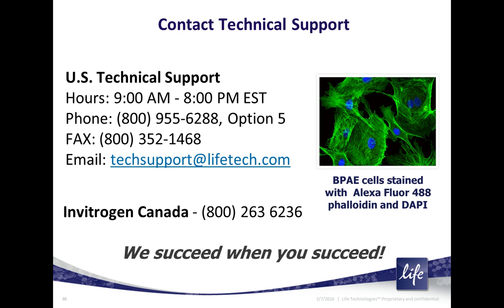For live cells, really, the best option is to either fix them or to try to just limit the light exposure. Sometimes if your dye is really sensitive and photobleaching quickly, it can help to have a second dye that's more stable, like Hoechst 33342, which is a blue fluorescent live cell nucleic acid stain. You'll use that dye to find your cells and get into your focal plane, and then you'll switch over to your photobleaching dye and take a picture real quick, right?